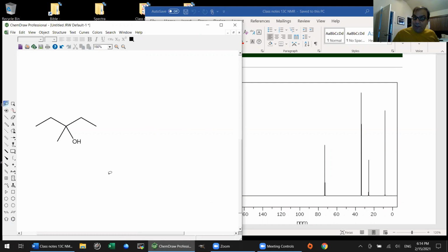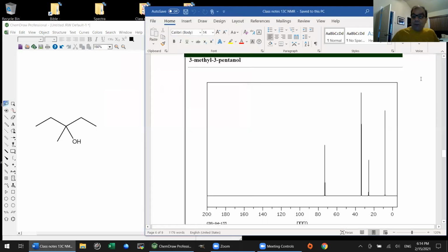We also notice that oftentimes, but again, it's not an always type of thing, the height of the peak is also proportional to the number of hydrogens directly attached to that carbon. That's often true, other things being equal. Maybe not 100% of the time, but probably 85 to 90%. And it's okay if something's not true 100% of the time. It's still a rule that you can trust. It's a pattern that you can trust. So that would be how I would assign those peaks. But regardless, I think we have a spectrum that's totally not surprising given the structure.